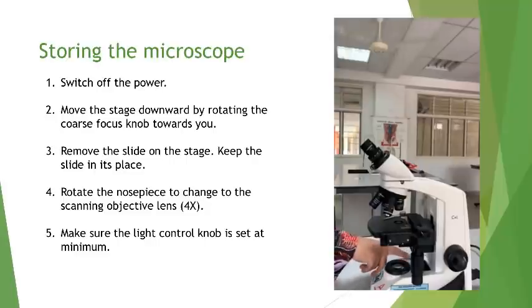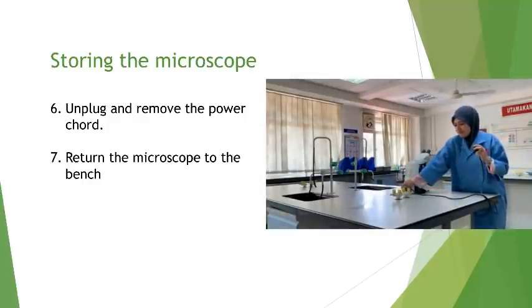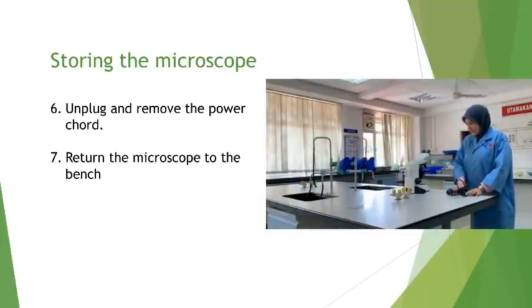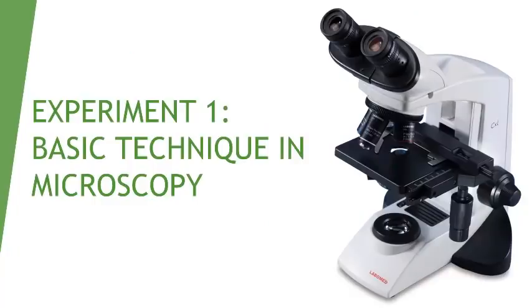Make sure the light control knob is set at minimum. That's all for experiment 1. Thank you.